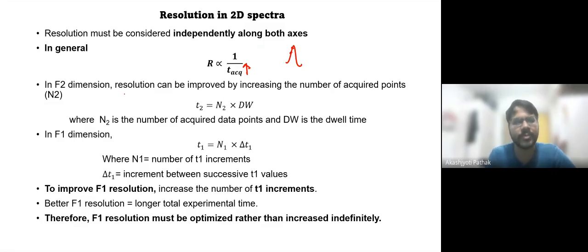time. When we are talking about the F2 dimension, in the F2 dimension you are collecting the FID.